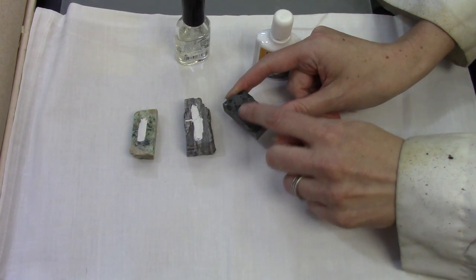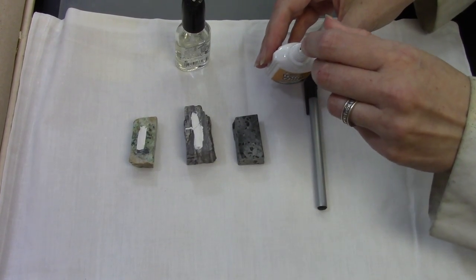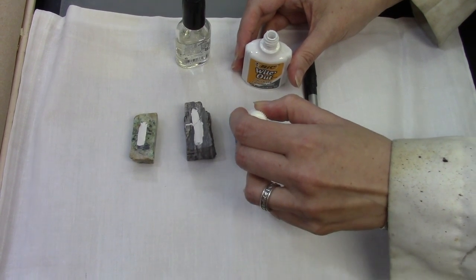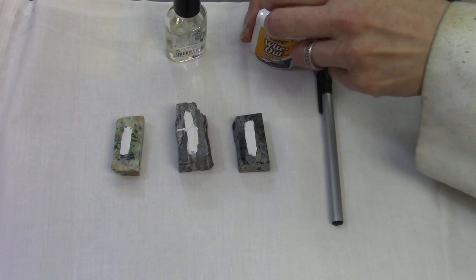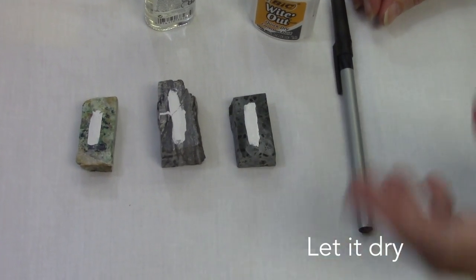For this rock, this is our polished side, so I'm going to turn it upside down and put a strip of whiteout or liquid correction fluid on the surface and wait for it to dry.